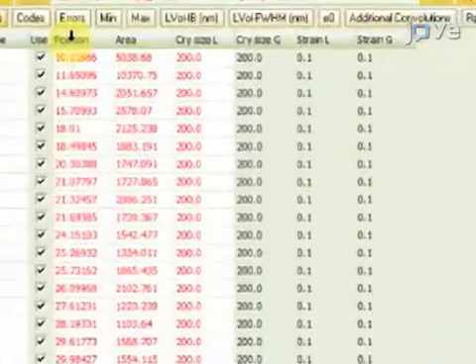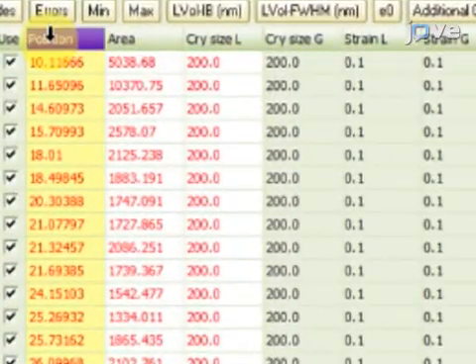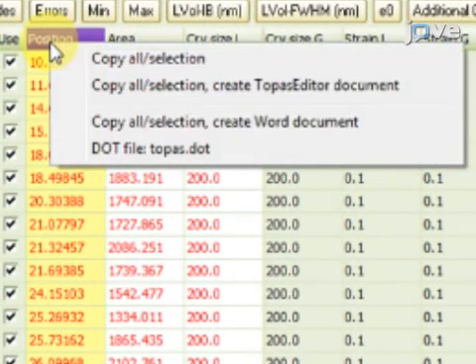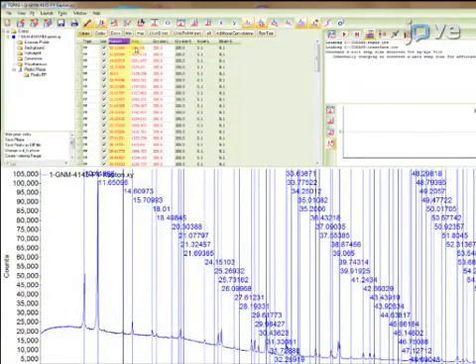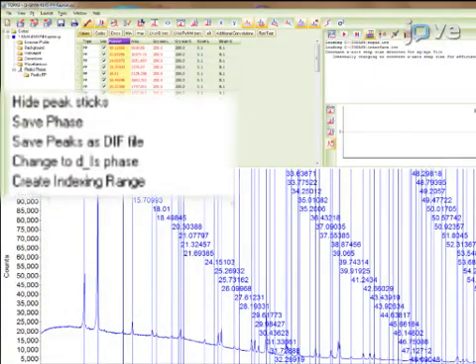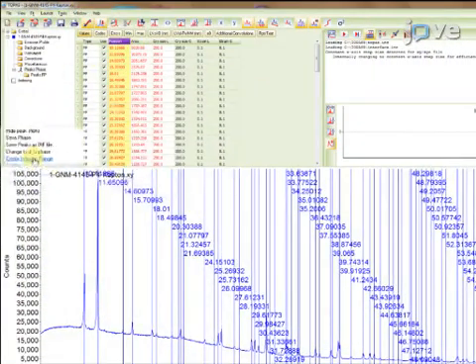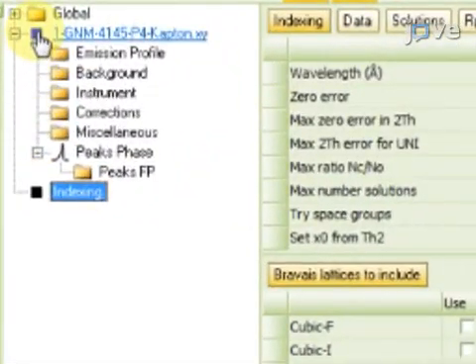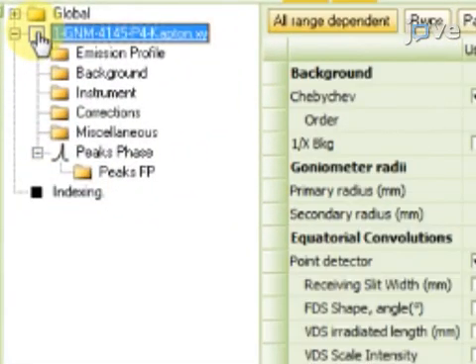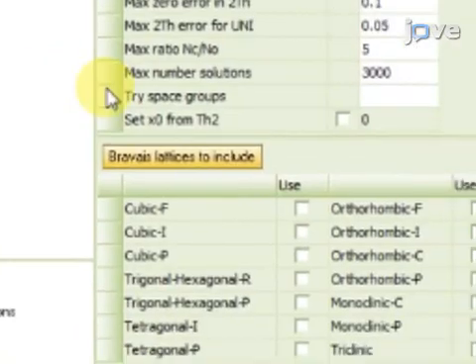Mark all peaks yellow by clicking on Position, then left-click in the yellow marked column. Copy the selection and select Create Indexing Range. Deselect the range, select Range Indexing, and then select all Bravais Lattices.